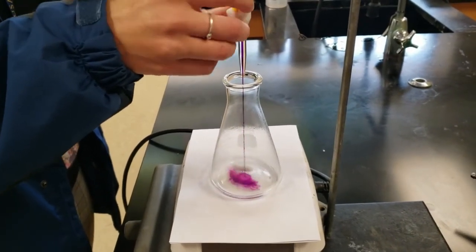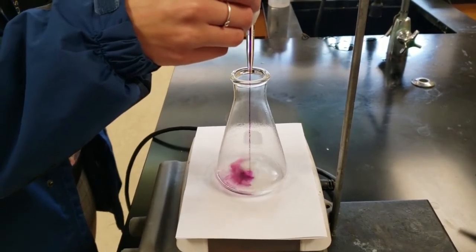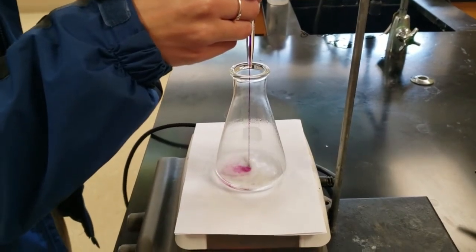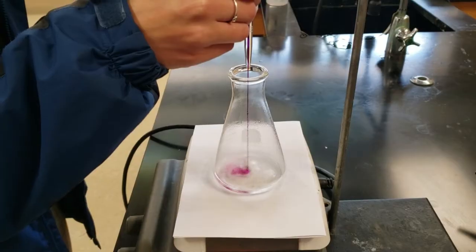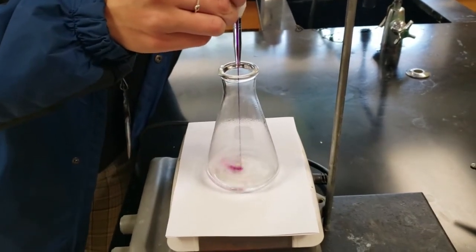If we keep adding the permanganate and it reacts, then we have an excess of the peroxide. If we have the permanganate persisting, then we have an excess of the permanganate. If we can make it so one drop changes it, then that's where we want to be.